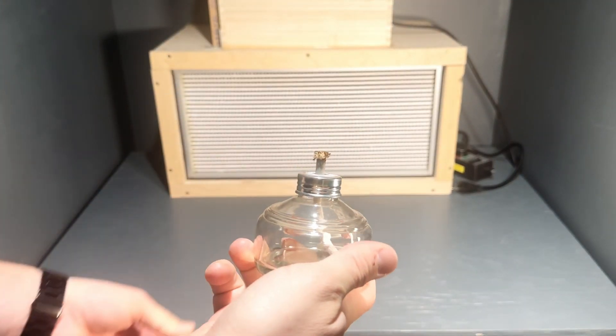A Bunsen burner or an infrared sterilizer. I have a Bunsen burner, but I'm going to make a video on how you can build an infrared sterilizer for under $50 — just waiting on the parts in the mail.